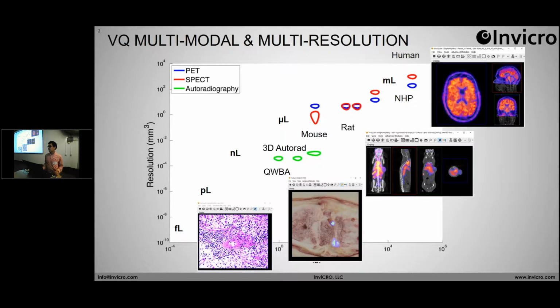And you'll see throughout our development, if you've seen our presentations in the past and what we're working on these days, we're just always striving to improve our ability to do multimodal analysis and to satisfy the needs of an imaging scientist looking to derive quantitative information from their images.